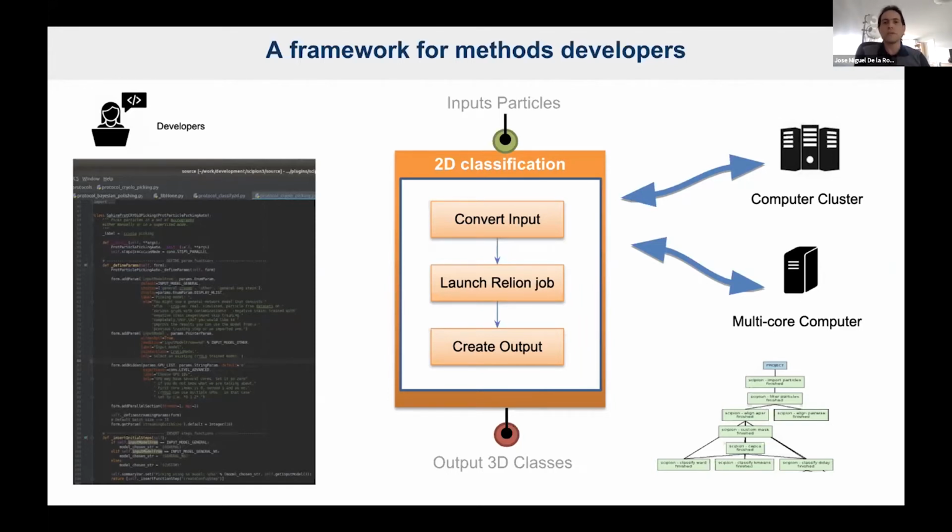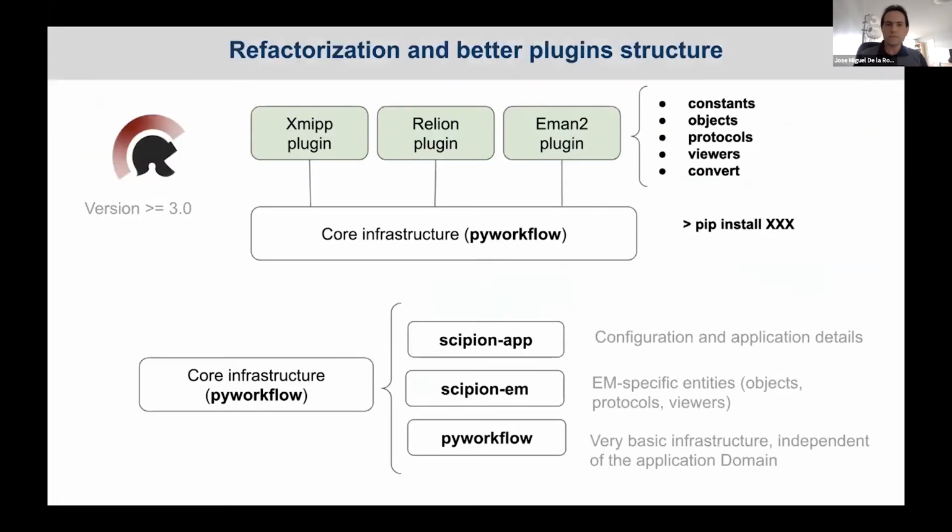So the talk today will be more about the work we have been doing for preparing the framework for this kind of users, for developers that want to add new methods, and trying to reduce the burden of writing a new graphical interface for analyzing the data and taking care of all this storage or database or conversions.